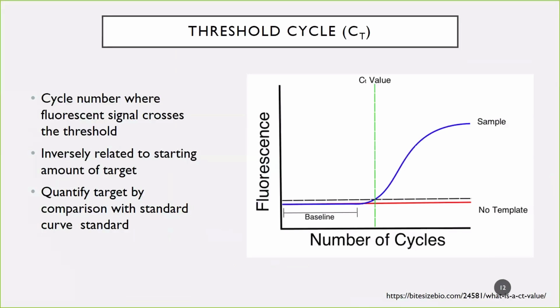I'm just going to briefly go over threshold cycle, or CT value, since a lot of the output for this project was using qPCR. The CT value essentially is the cycle number where the fluorescent signal crosses the threshold, and it's inversely related to the amount of your target. So the lower the CT value, the more of your target, in our case, influenza A virus in our sample. Next slide.